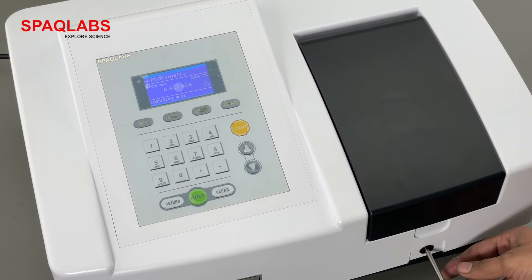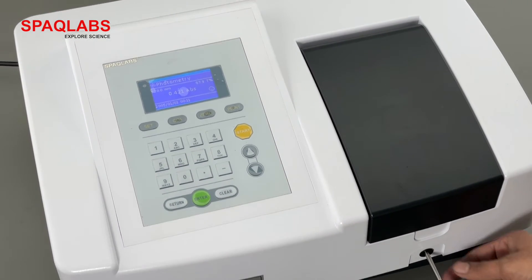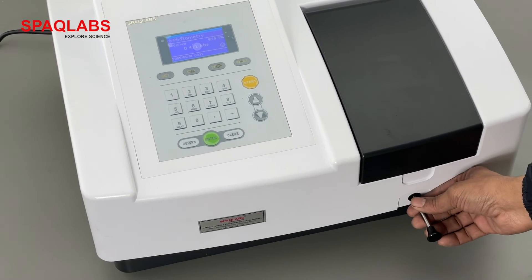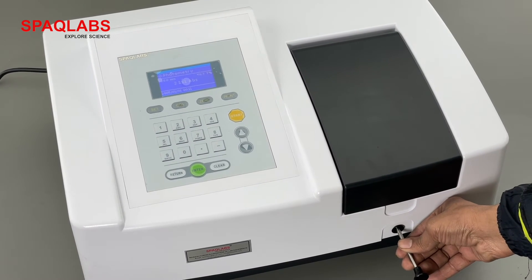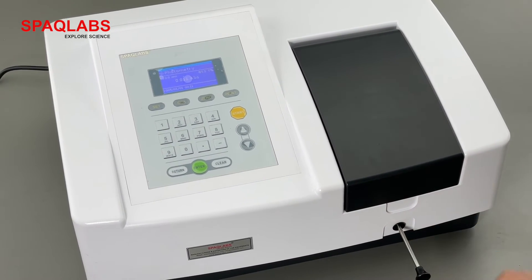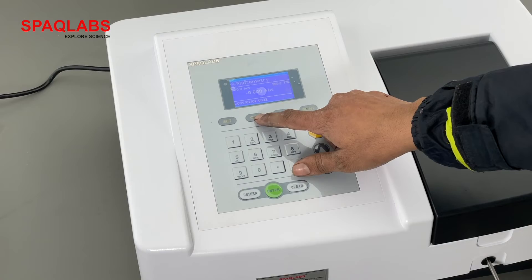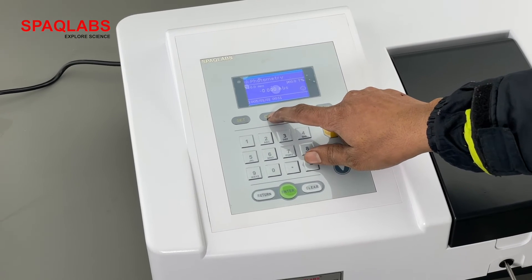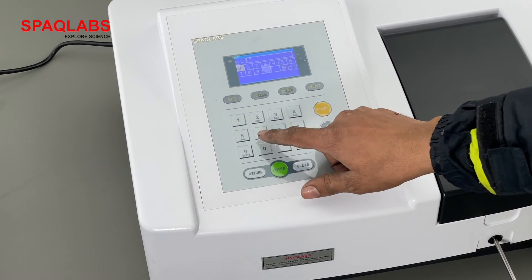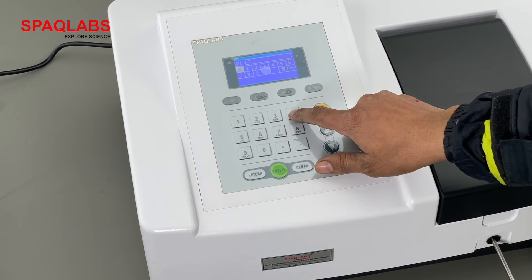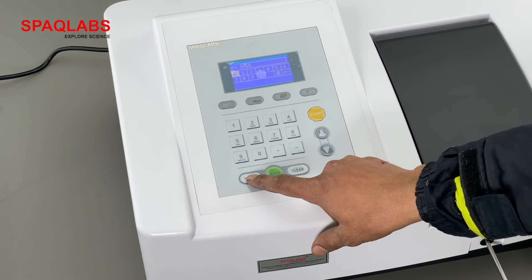Now let's do this again for a different wavelength — for example, 450 nanometers. Set the cuvette back to distilled water, go to select wavelength, press 450, and then press return.